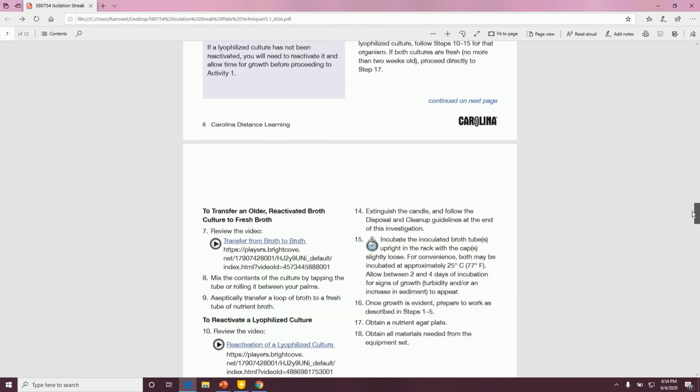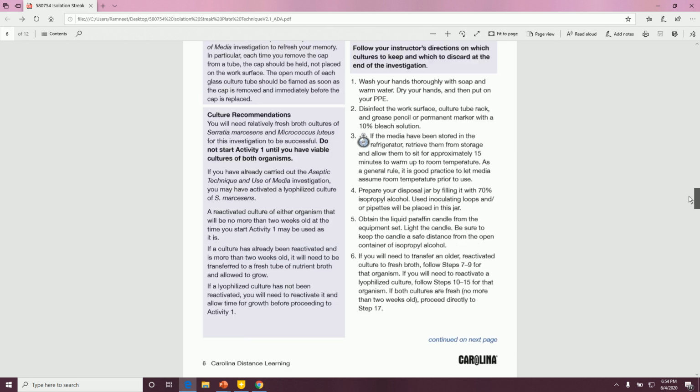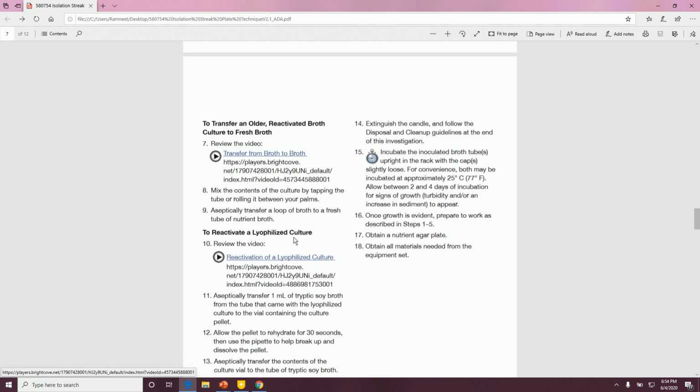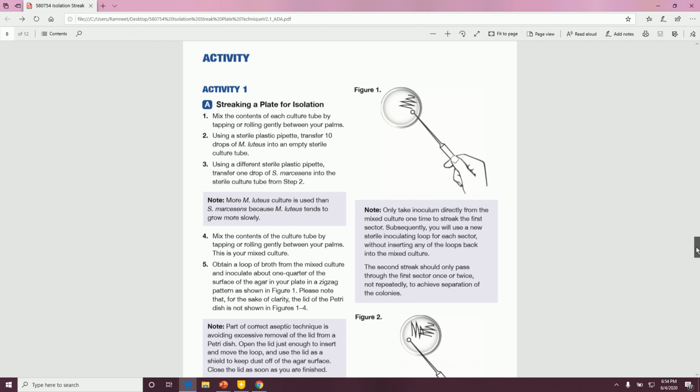Okay, so basically let's go over the steps of streaking. And again, here are some videos by Carolina. Please watch them. They explain very well how to reactivate a lyophilized culture. You have seen this in the last lab also, but if you want to watch them again, please do. Now I'm going to go over how to do the streaking, each and every step.